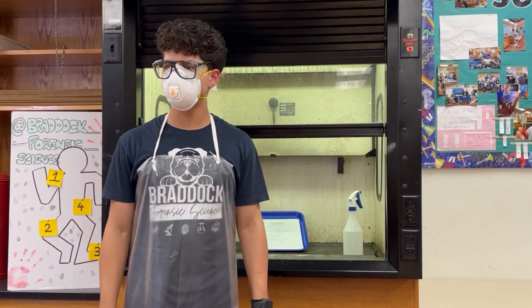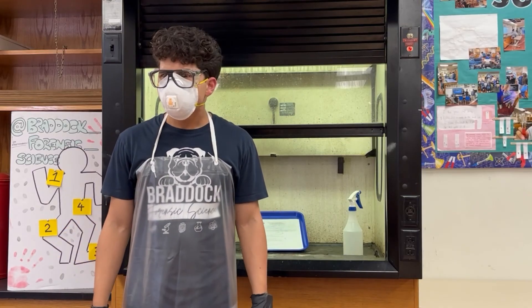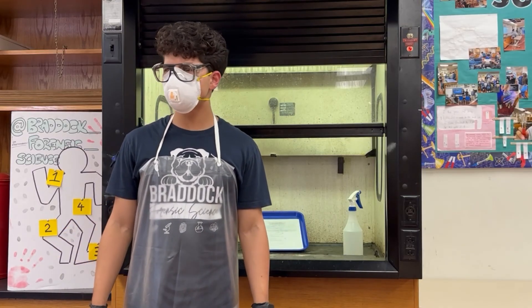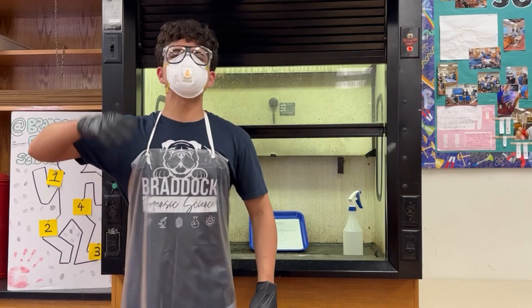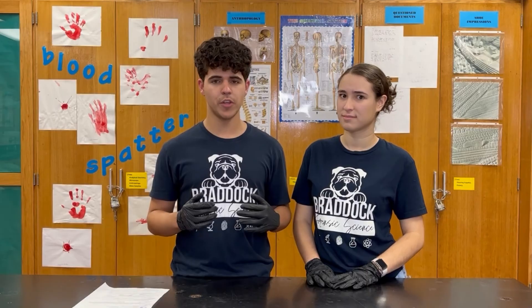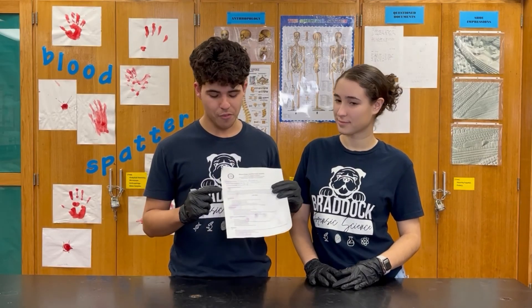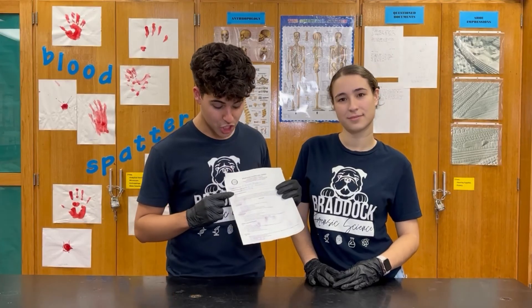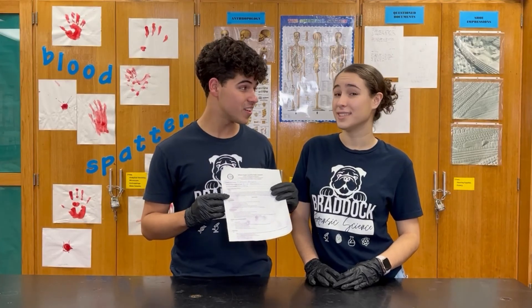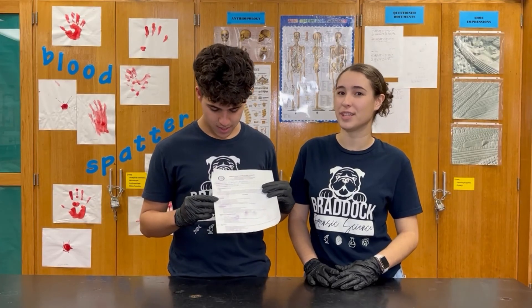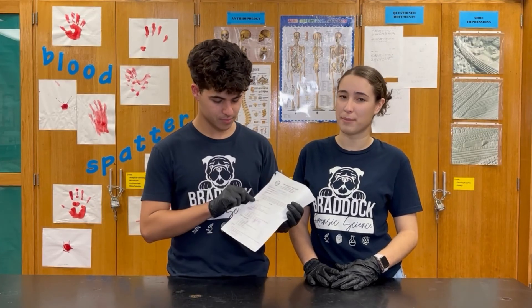We wait — about two hours. We're skipping the two-hour wait time, as that would have been a very long video. And we've brought you back the results. As you can see here, the fingerprints turn purple. This is due to the chemical reaction between ninhydrin and amino acids. These stain marks are super easy to photograph, and you can send them to the lab for a later comparison.